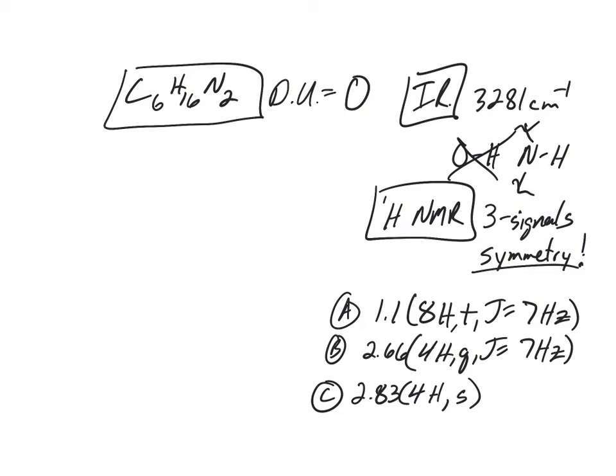Now, this makes it a little tough. I probably would have just said there's a broad peak with 2 hydrogens. I probably wouldn't have said it's underneath and made it a little more complicated. So there's 2 NHs. That's what this is telling us. So really, this isn't worth 8 hydrogens. This is worth 6, because the other peak, the NHs, are hidden underneath there.